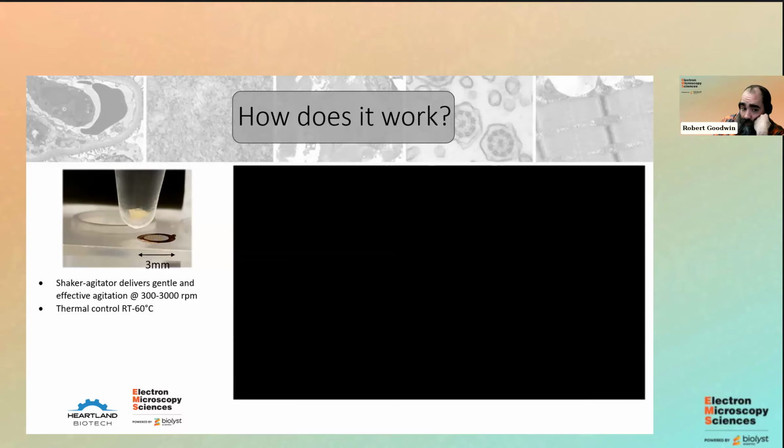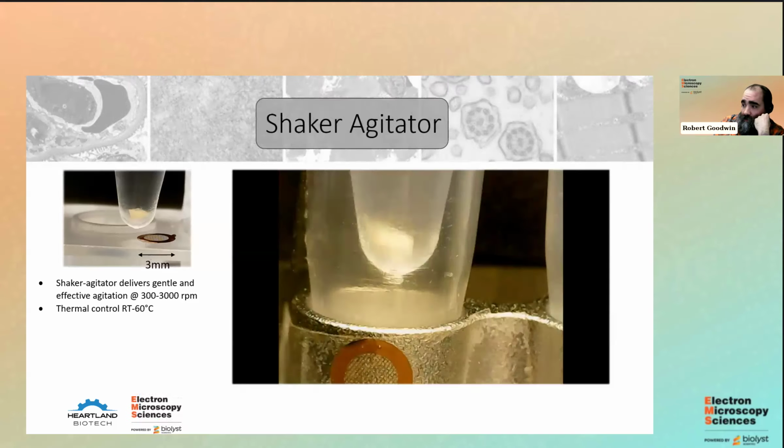All right, so that's just a quick overview, quick video. It's basically that pipette just moves the chemicals around. We have used other ones in the past where the tissue is attached to the pipette, so it was very limiting. You could only run 8 samples at one time. This allows up to 96.